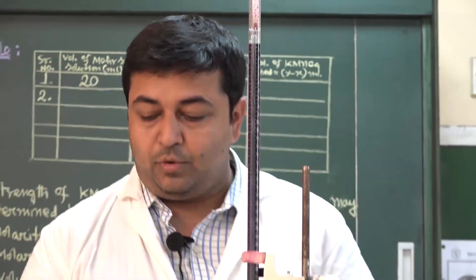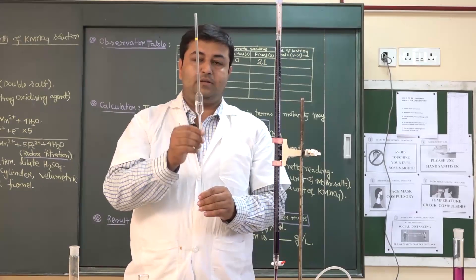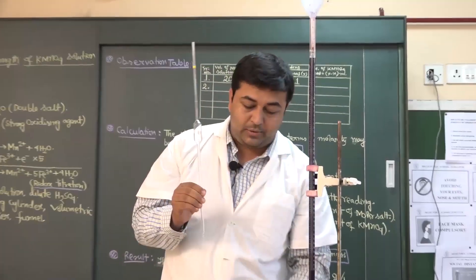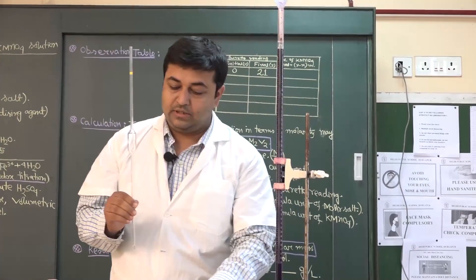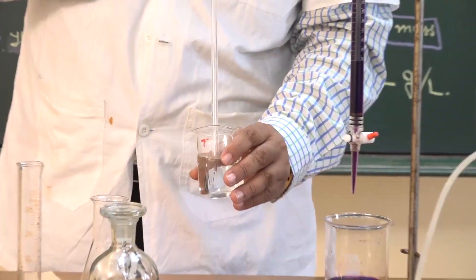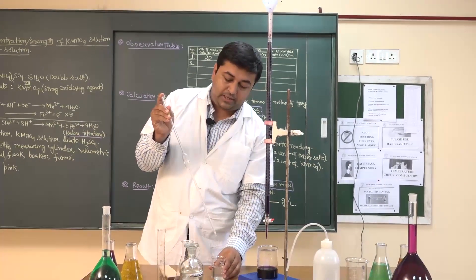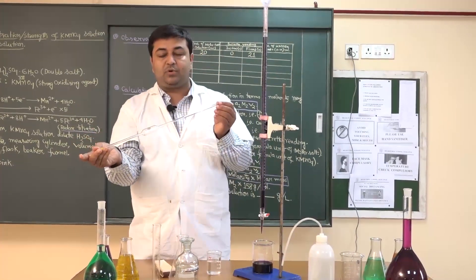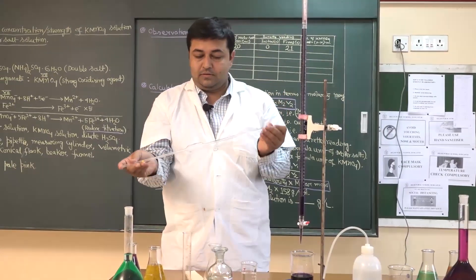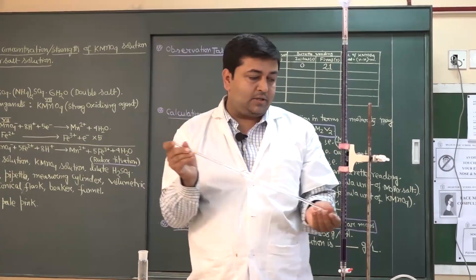Now I will take Mohr's salt in the conical flask using a 20 ml pipette. Mohr's salt is present here. Before transferring the Mohr's salt, I will first rinse the pipette. I take a little Mohr's salt solution, roll it, and discard it.